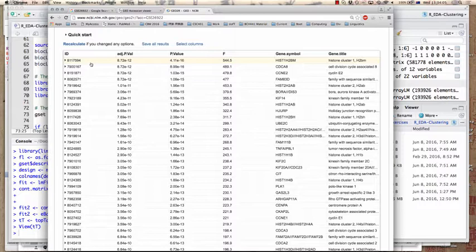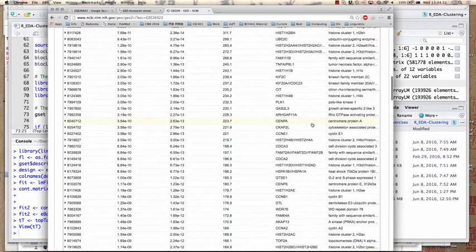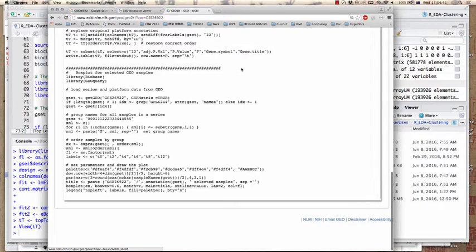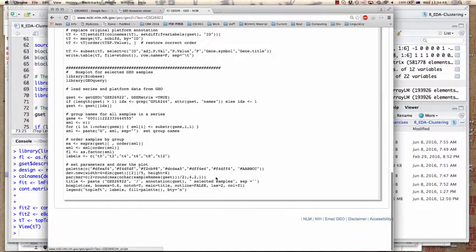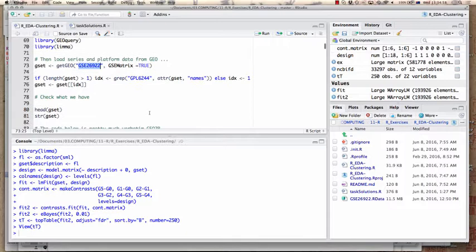The output is sorted by ID and adjusted p-value. The top result is histone1h2bm, which apparently has a highly significant expression change. Clicking on it shows the actual distribution of values, up to the top 250. The entire procedure that calculates these values is available as an R script, which you can download and work with. That's exactly what I've done for the first part of this tutorial — used that procedure to reproduce what happens on Geo2R and find the top 250 differentially expressed genes.